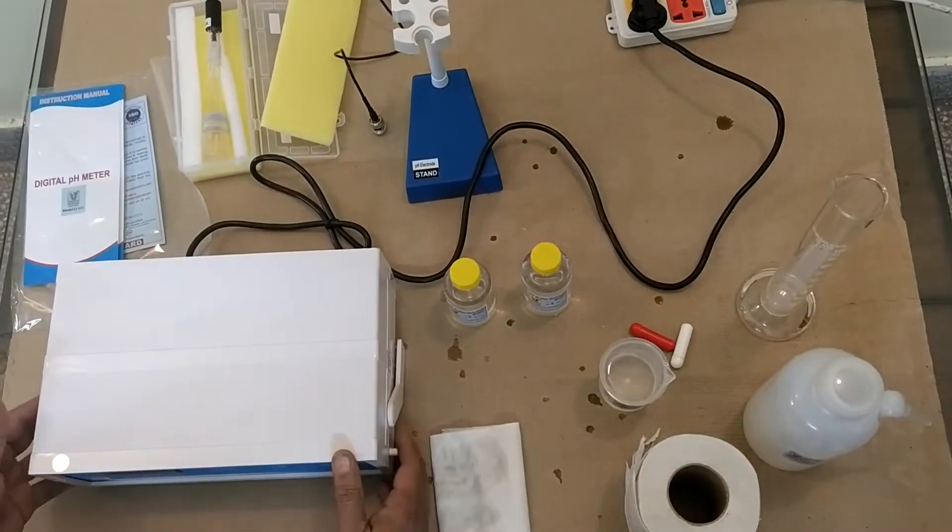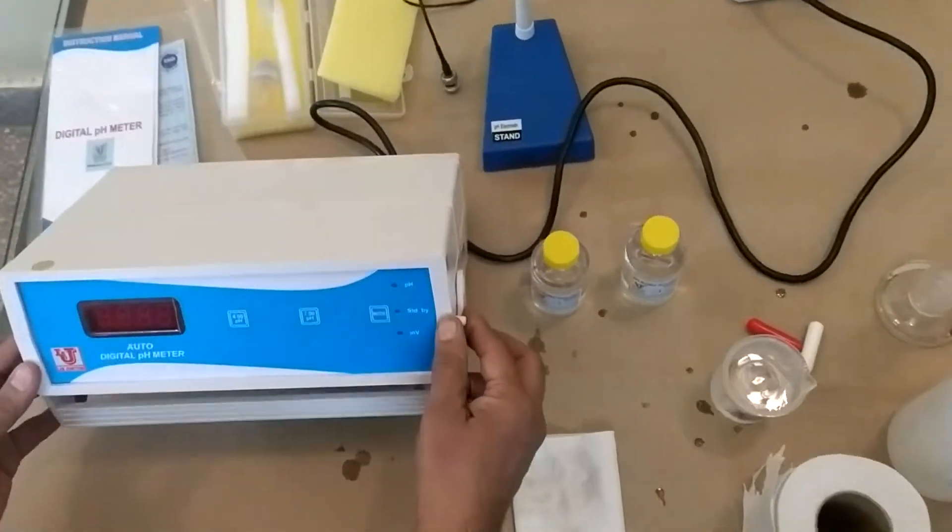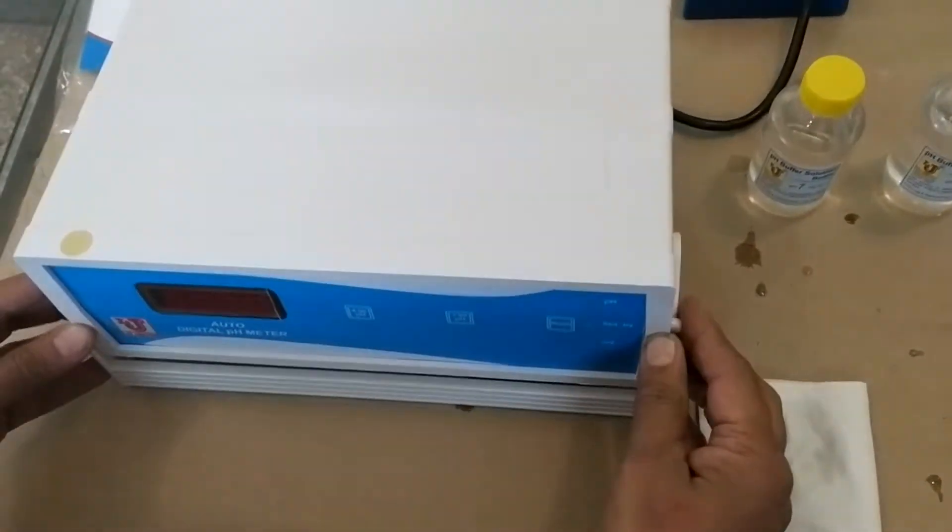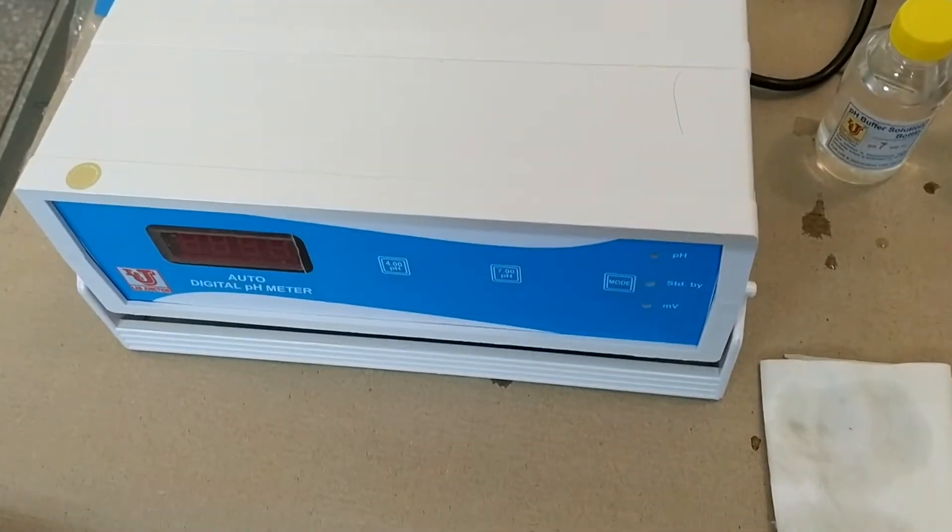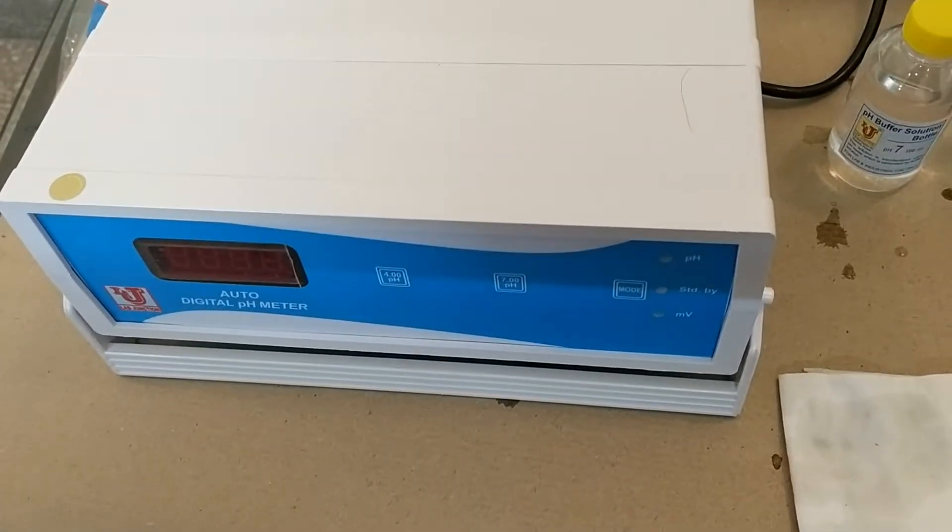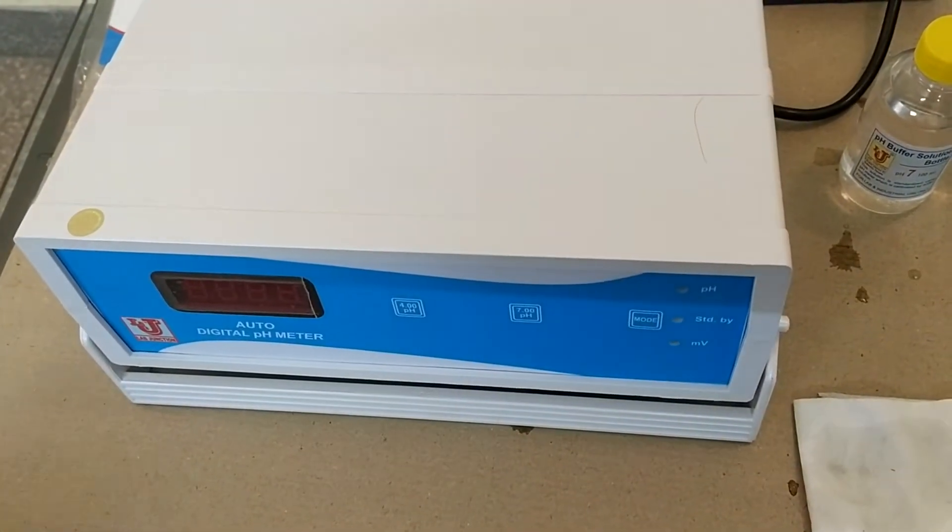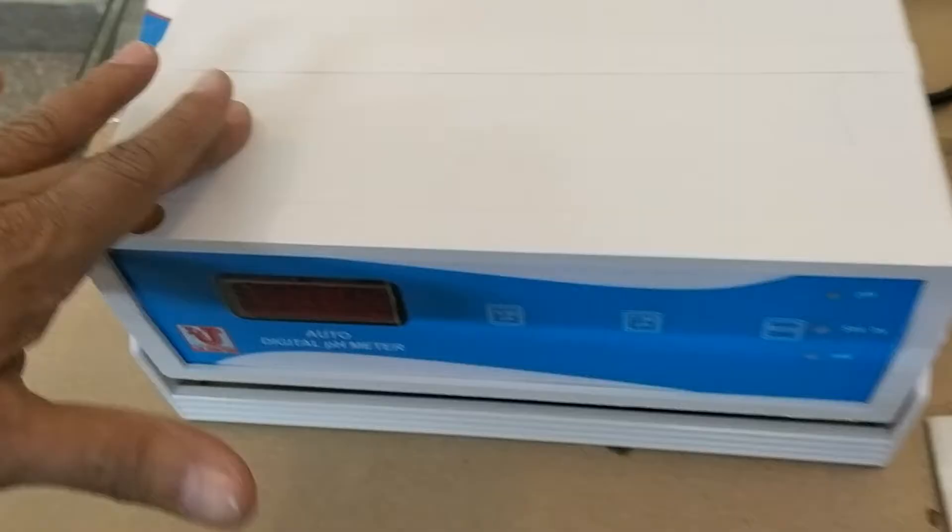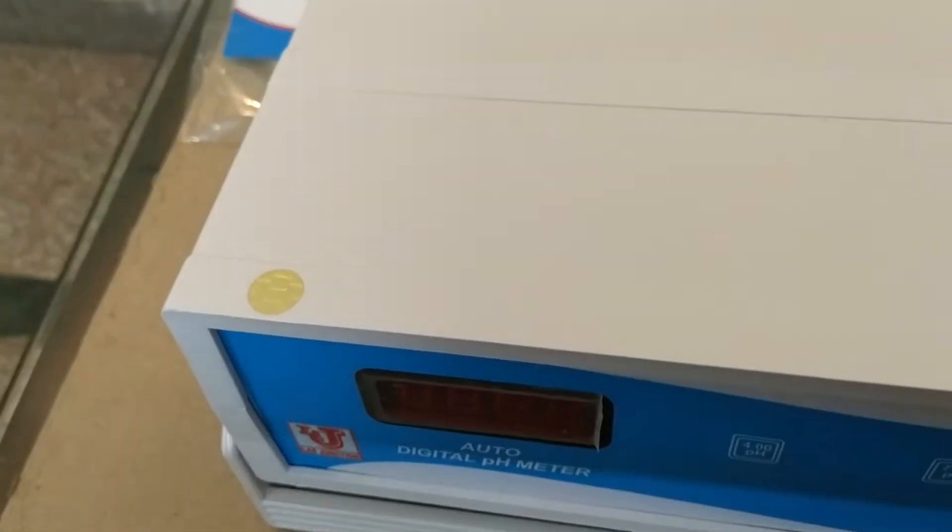I have junctions auto pH meter, auto digital pH meter. This is the pH meter LJ111.